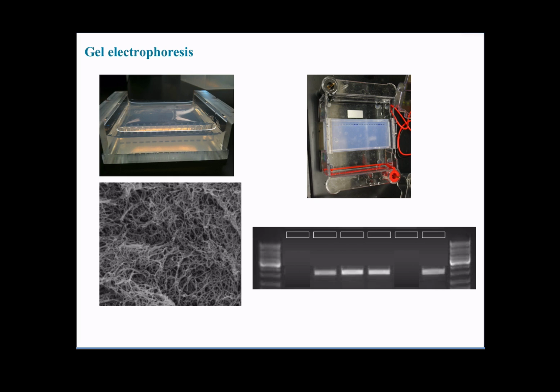If the sequence of interest that we were after was not present in the sample, the PCR reaction won't work, and we won't really see much, because the large amount of DNA that was present in the genomic background of our sample has been fragmented into many different fragments of different sizes. It's not like it's not there. It's just that we don't see it because it doesn't concentrate in one place. Okay? So it's much more distributed, and we simply can't see much of it.